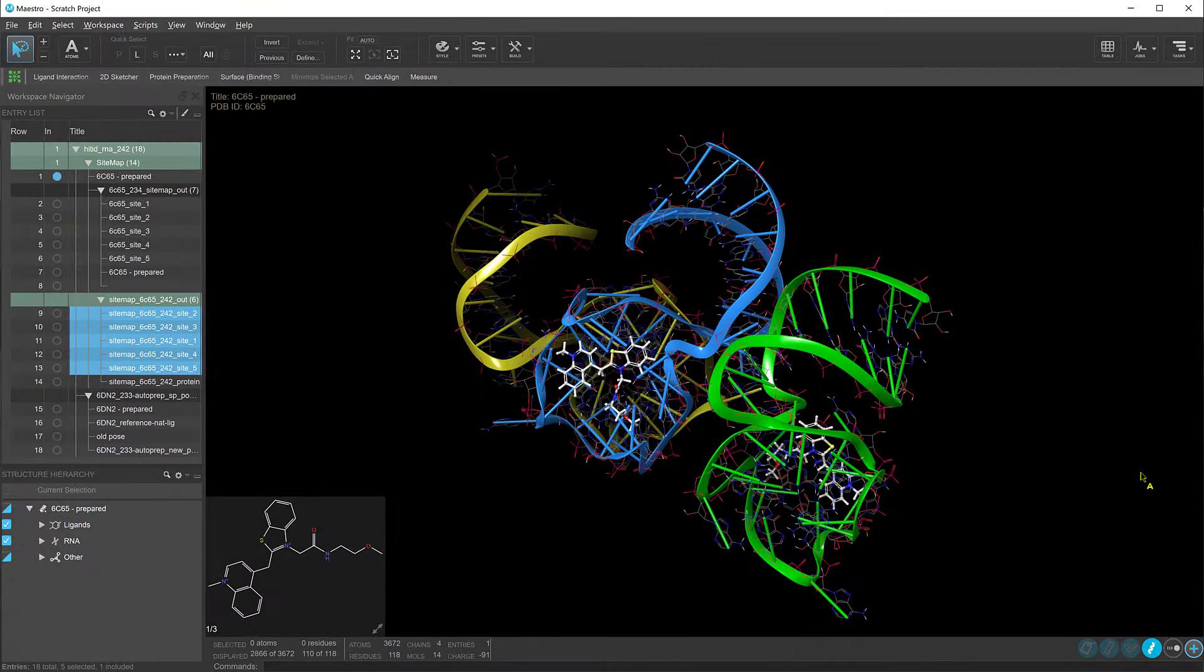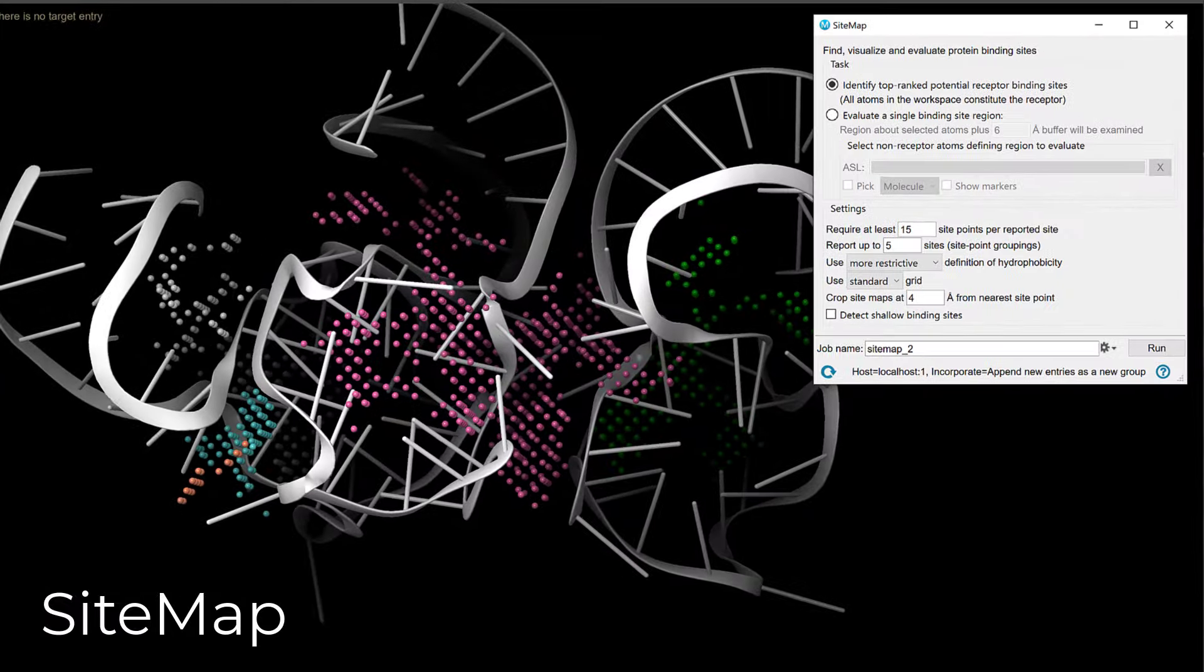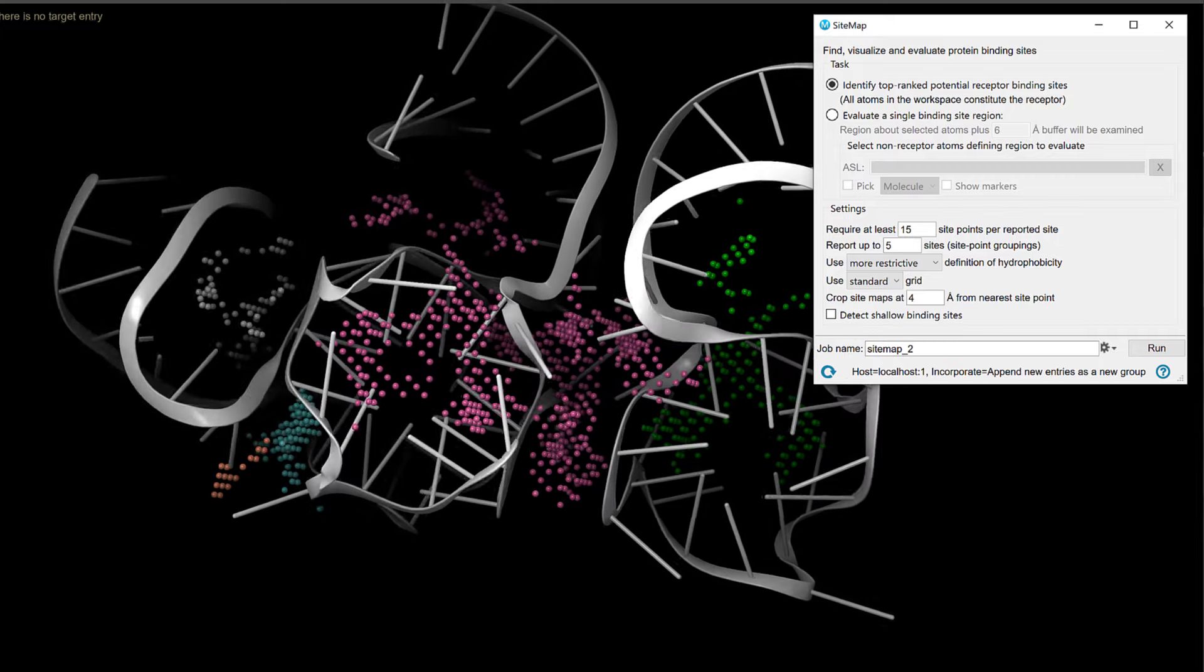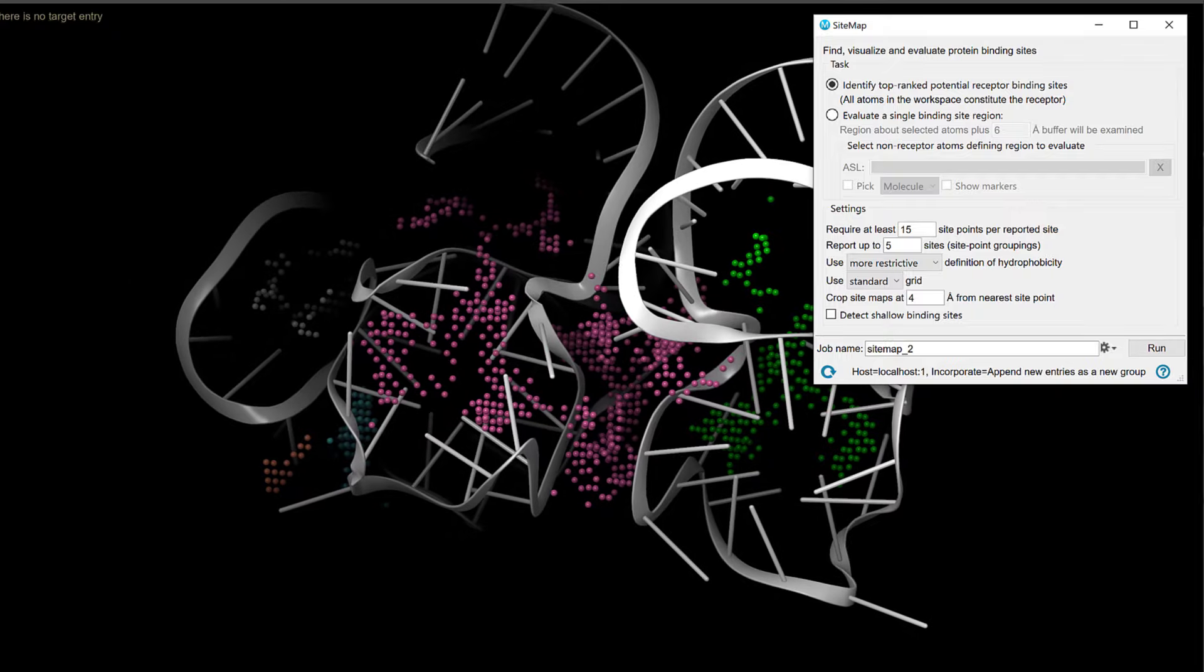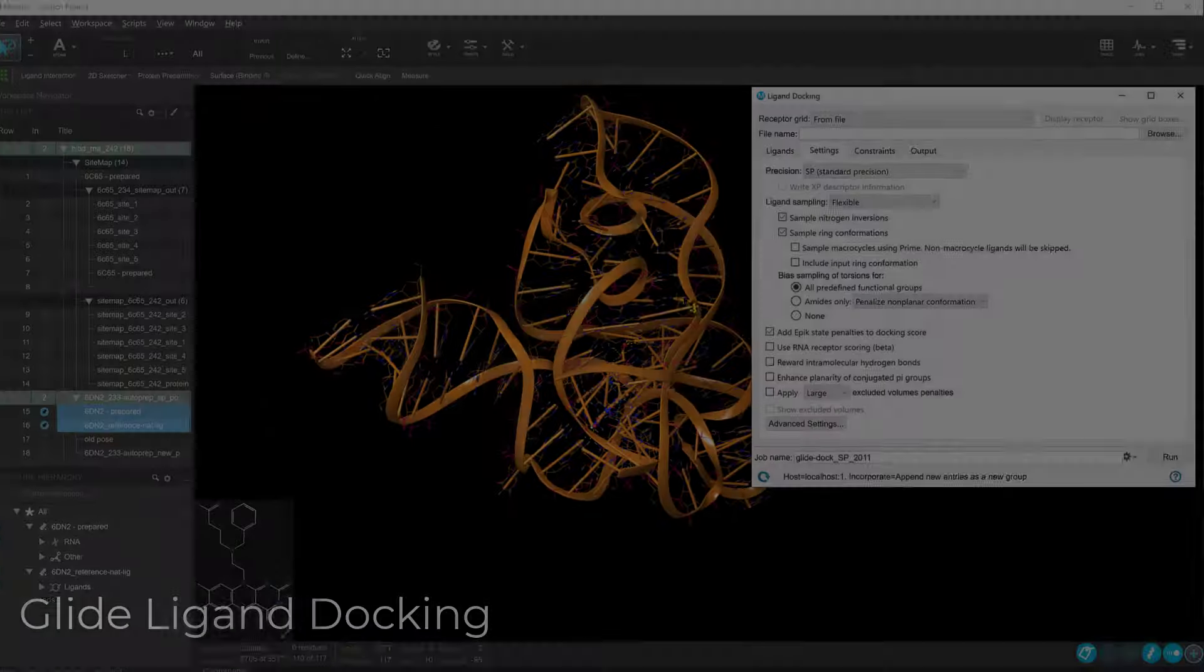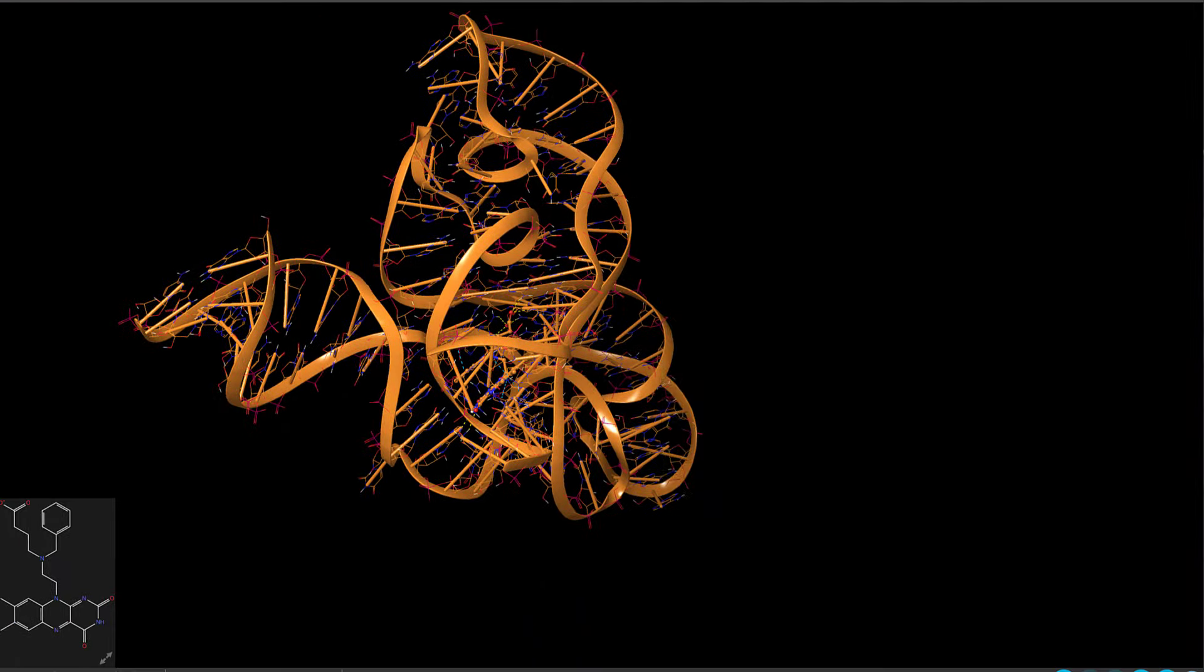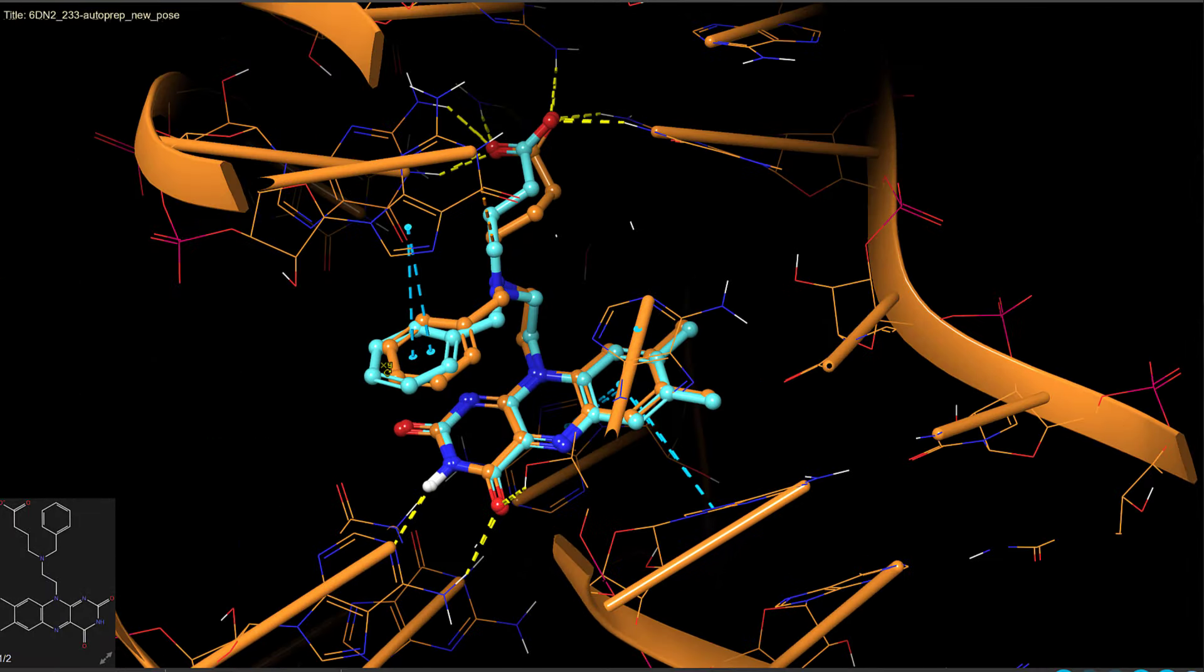Improved support for RNA receptors is seen throughout the suite. In sitemap, we see more accurate identification of RNA binding sites, with 89% of RNA sites in the HARIBOS set now identified as the top-ranking binding site, up from 69% previously. While in glide ligand docking, there is a new option that allows for improved pose prediction and virtual screening enrichment when docking small molecules into RNA receptors.